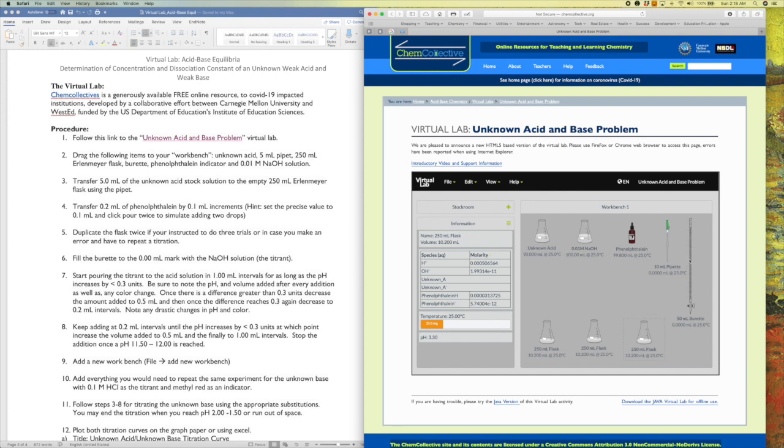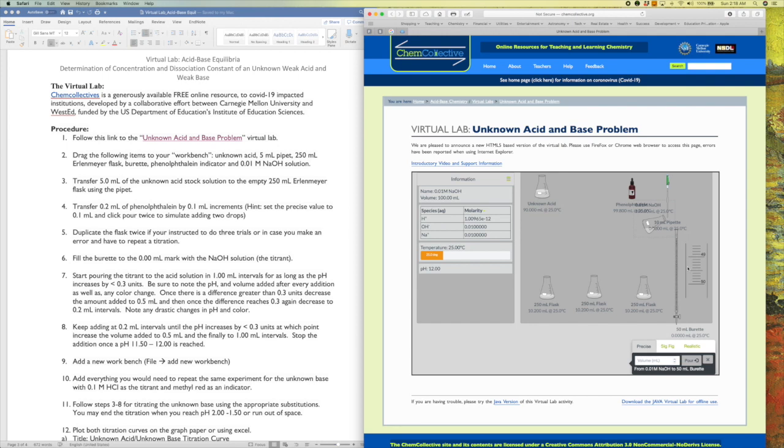So I have my burette here, and this is a 50 milliliter burette. And so I am going to hover my titrant, which is the sodium hydroxide, over the 50 milliliter burette. And now again, I see that it's asking me for a volume. So notice here with the burette, the magnified portion it's showing us is here on the bottom, the 50 ml. So here on top will be the 0 ml mark.